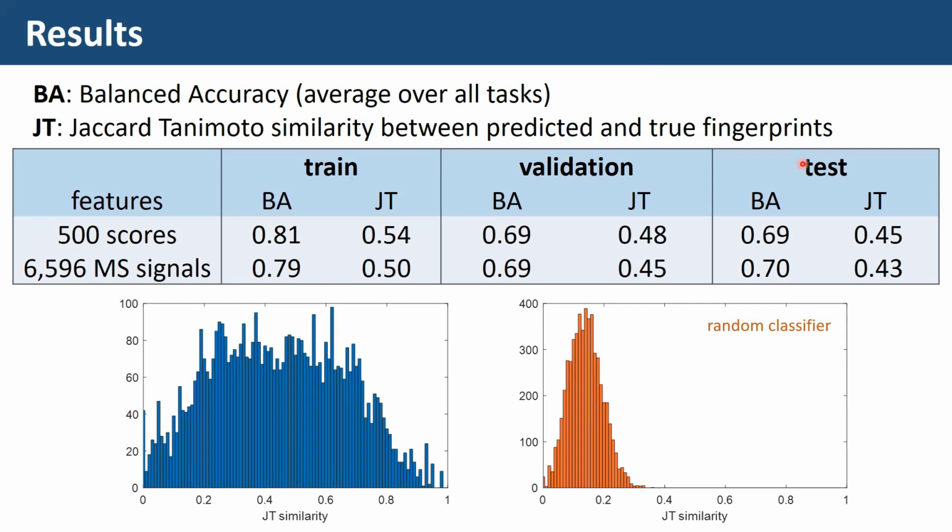Once we have identified some issues in the predictions, you can try something like this. It's a good option to make a kind of, how do you say, a tree of models, okay? So a multi-block model, kind of.